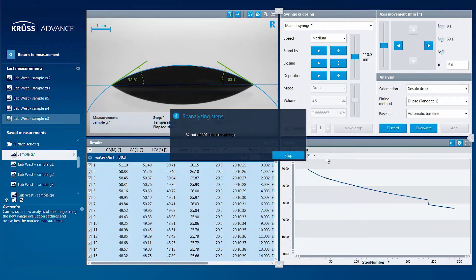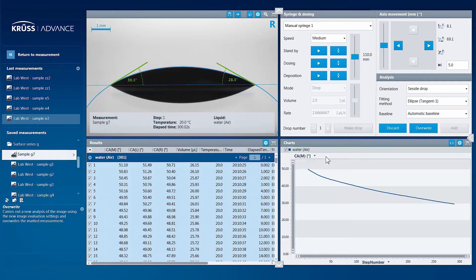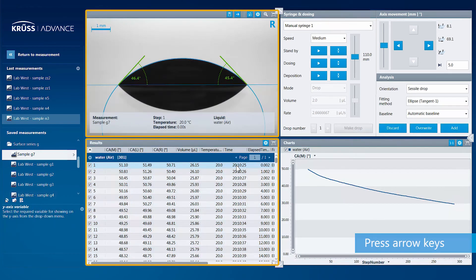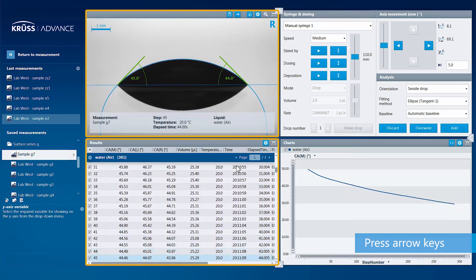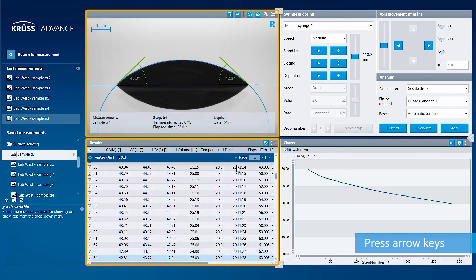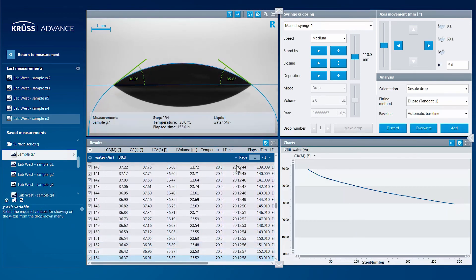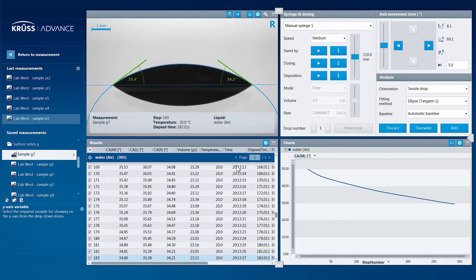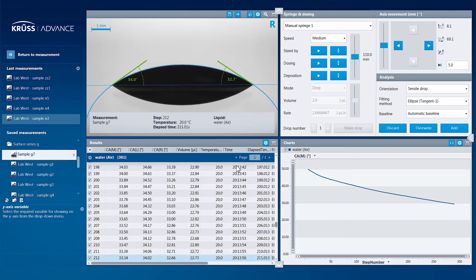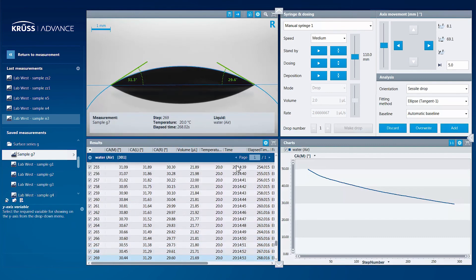This feature even has the ability to play the individual frames back like a stop-motion video. Just select an image and hold down either the up or down arrow key, and Advance flips from one image to the next, making the dynamic process of surface science measurement visible to you.